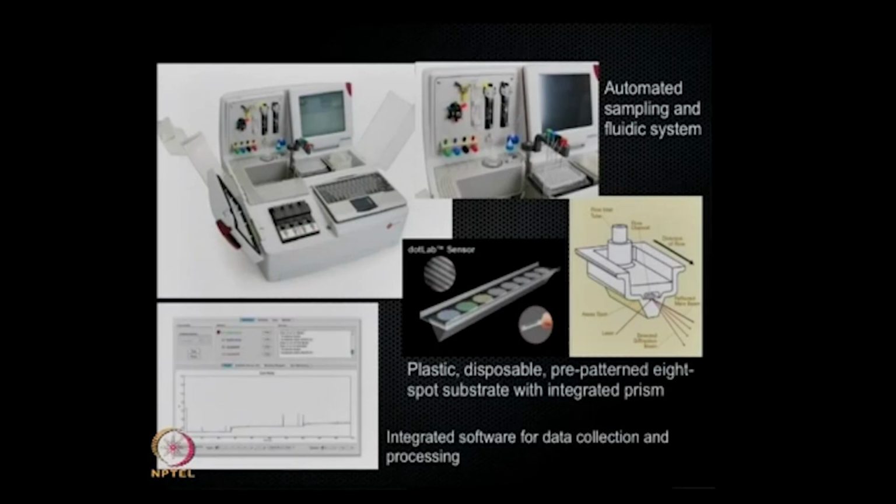And it has the little sample cell that has 8 spots in it that you can put down different proteins or different snippets of DNA or whatever biomolecule you're trying to assay. So now you are providing the multiplexing capability. Yes, it has multiplexing here. Instead of on top of each other, it's now in 8 different spots.